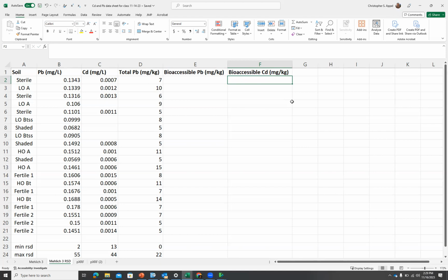Well, this is milligrams of lead and this is grams of soil, and we want to end up with kilograms of soil, right? Oh, okay. Yeah, I'm sorry I didn't put the kilograms of soil, but yes, we want to end up with kilograms of soil. Okay, so we just multiply all those things by 10, and then we fill it down, and then we're done.